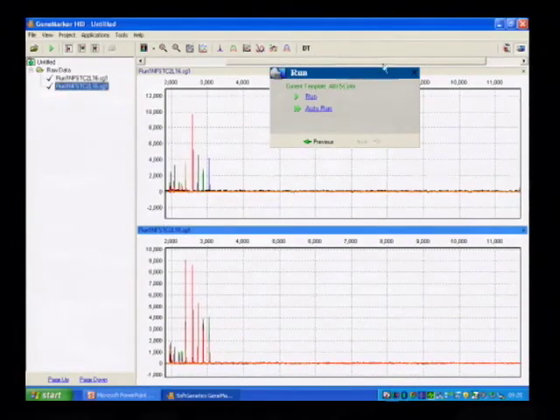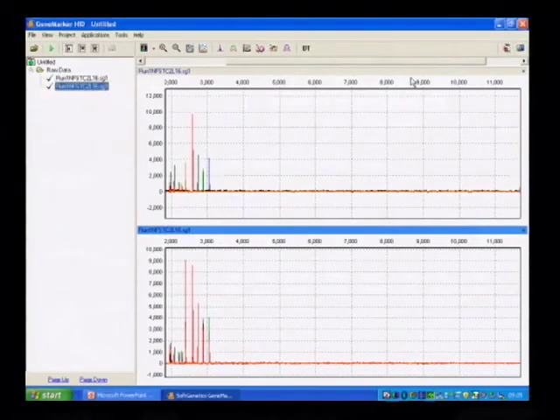Essentially what I've done is add two versions of the lane 16 that we have. The version up here has been processed by the trace processing software. This version down here is raw data, which has not been processed. If we zoom in on the blue, the raw data has overlap. This is only the blue trace, but then you see green, yellow, and red as well. After trace processing, you only see blue.